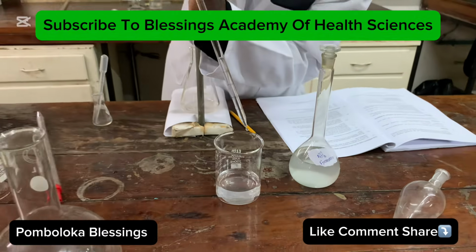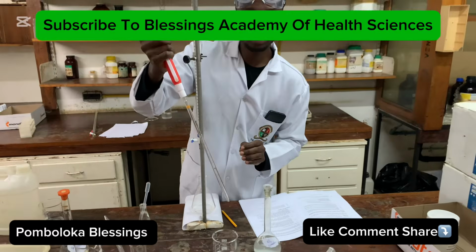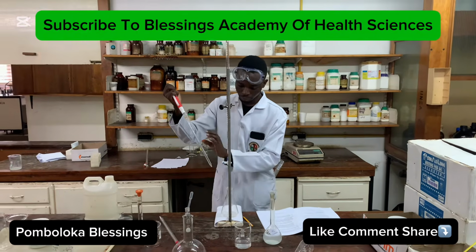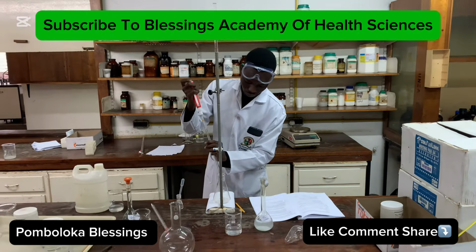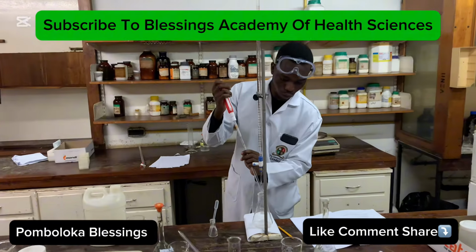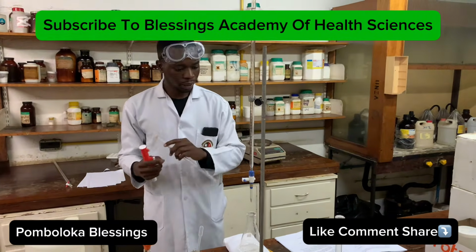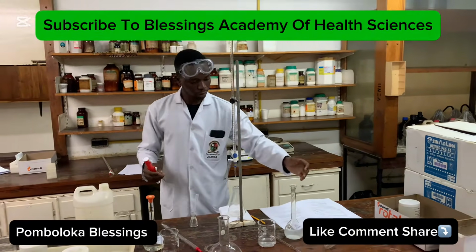Okay, so that is 5. If you check from here, we already have the 5 cubic centimeters of the ammonia. So we just have one group today. Okay, we have put that in our conical flask. That is the first part of the experiment that we're doing. We're mixing 5 cubic centimeters of the ammonia, which has already been mixed right there.